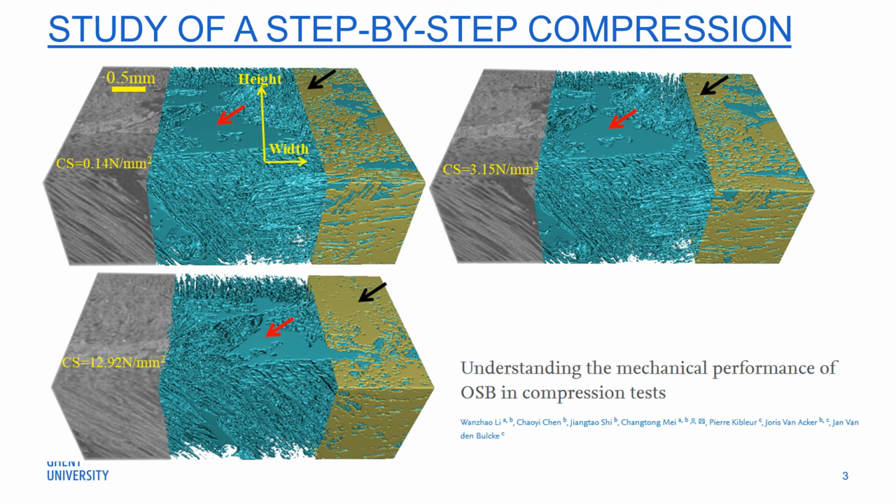We also did more quantitative analysis with image processing. We segmented the air and the wood phases and looked at the evolution of the air phase through compression. More details can now be found in this paper, which was published about a month ago.